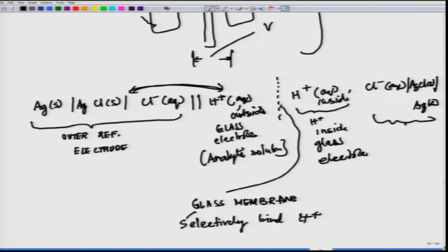So, this is your inner reference electrode. So, you have two reference electrodes, the inner reference electrode and the outer reference electrode.